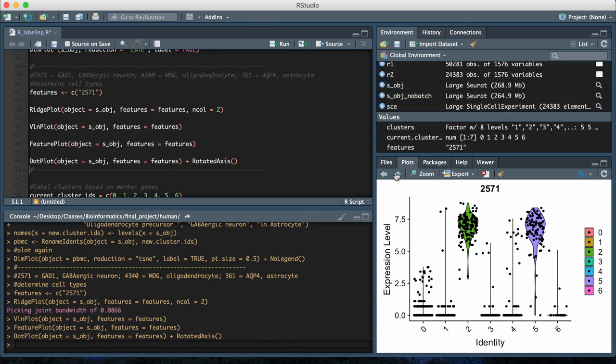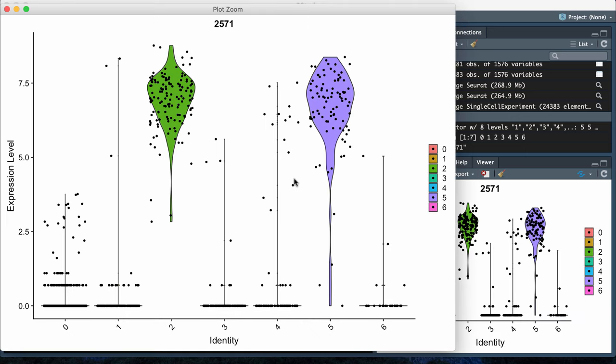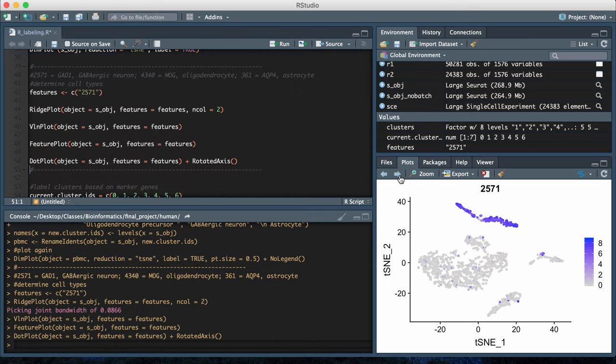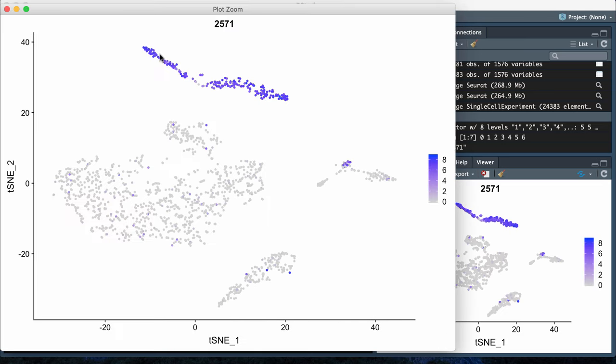Then if I go to the violin plots, it's showing me a similar conclusion. Again, it's looking at high expression level at cluster two and cluster five for this one genetic marker. Then the feature plot is showing high expression for this area of the t-SNE plot, and this area is cluster two and cluster five. Again, we're seeing high expression in those two clusters and less expression in the other clusters.